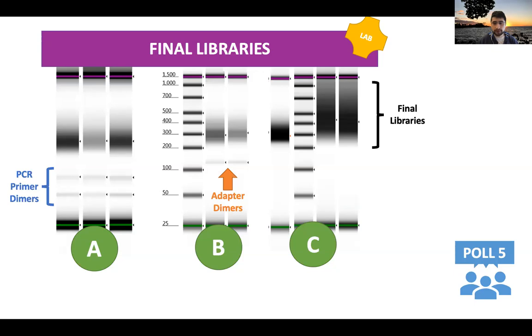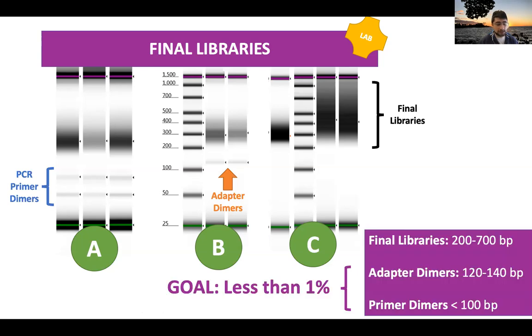All right, it's probably written in the next slide. So you guys cheated. I'm pretty sure you cheated because usually I have some A's and B's among the answers. But yes, the best type of library preparation is C, okay? And I'm gonna explain the reason why.